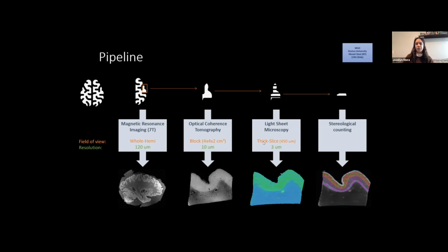To give a general understanding of why we collect this data and what it's used for: at the MRI level, we use this data to establish a macroscopic reference coordinate system of the laminar and cytoarchitectural boundaries. Then we do cell counting, which is obtained with traditional immunohistochemistry, as well as a custom-made inverted confocal light sheet microscopy for 3D imaging at the cellular resolution. Finally, polarization sensitive OCT, or optical coherence tomography, enables registration of distorted histological cell typing obtained with light sheet microscopy, which can then be registered back to the MRI coordinate system.